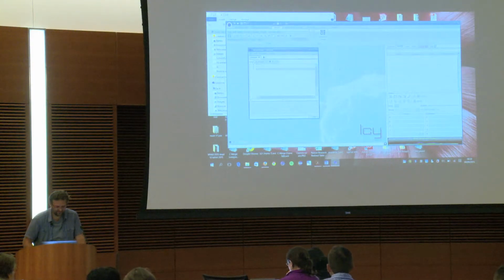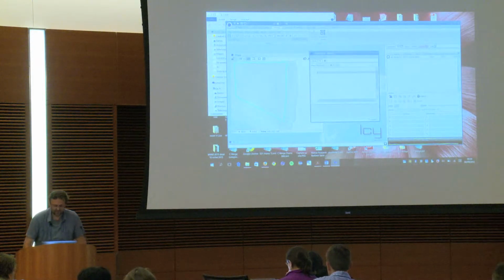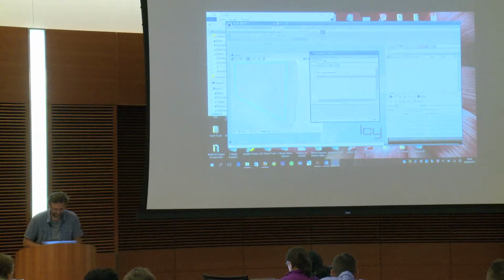So if I want, let's say I have a sequence, just to show you how easy it is. So you don't know anything about the scripting, and you want to get the active sequence in an object that is called sequence. So you get sequence, and you see it looks like I killed a trainee to do this, and it looks like in Eclipse.